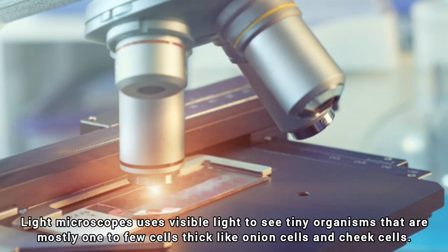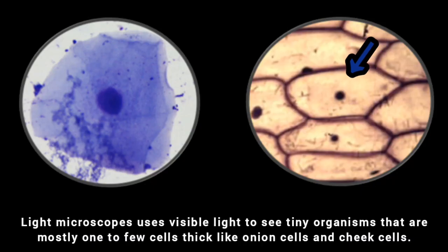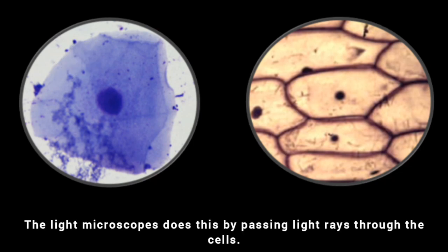Light microscopes use visible light to see tiny organisms that are mostly one to a few cells thick, like onion cells and cheek cells. The light microscopes do this by passing light rays through the cells.